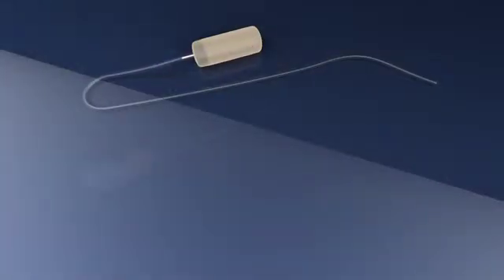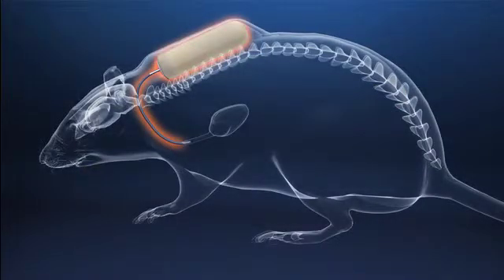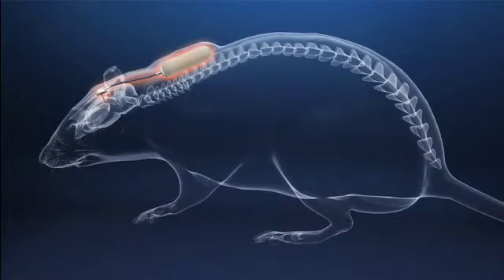Attachment to a catheter enables direct administration to various target organs or tissues, including blood vessels via ALZ jugular and femoral catheters, the spinal cord via ALZ intrathecal catheters, or into the cerebral ventricles and brain parenchyma using ALZ brain infusion kits.